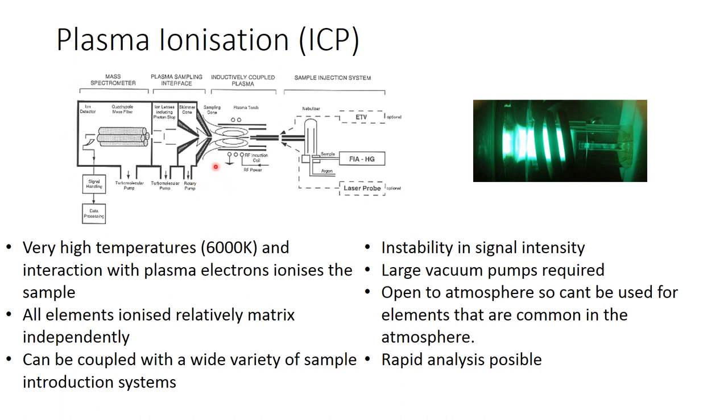So what we need to do is somehow get our ionized samples inside this thing without allowing lots and lots of air in. And the way we do that is by a series of very small holes in our mass spectrometer, usually in something that's cone-shaped. And then we have very, very efficient, not necessarily big, vacuum pumps that maintain a gradient of pressure from outside the mass spectrometer to inside the mass spectrometer.